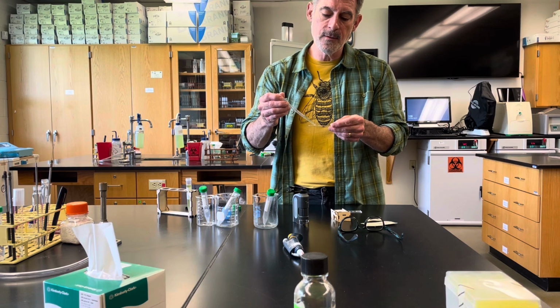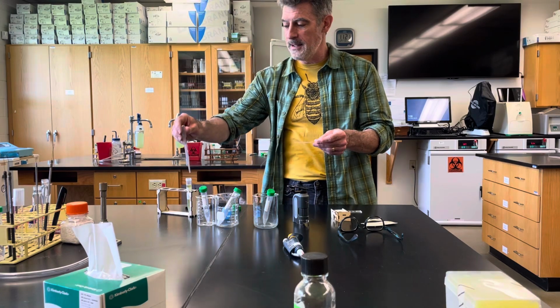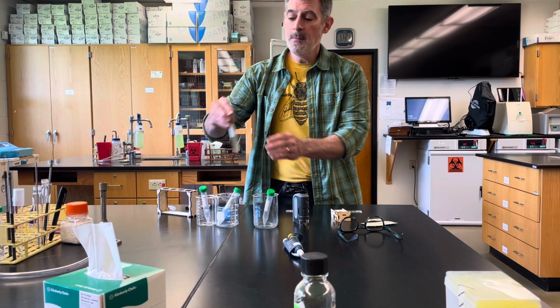You're just going to put that drop to the circle, and you'll see liquid get sucked right under the cover slip. That's it. You didn't really use anything much of it. You need a very, very tiny amount. Something else to keep in mind.